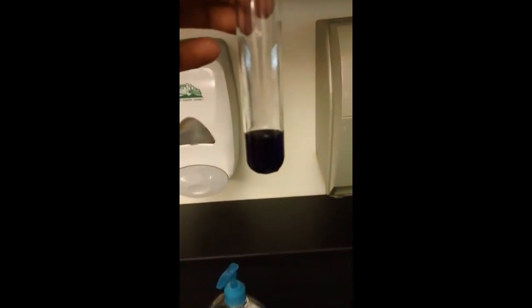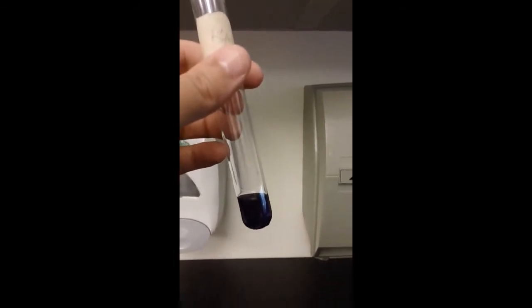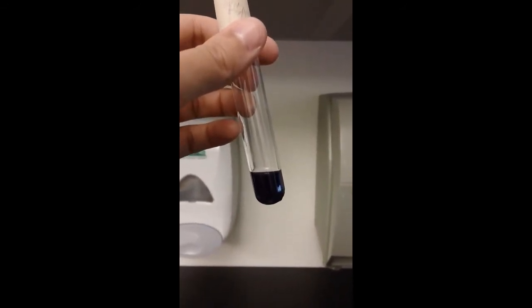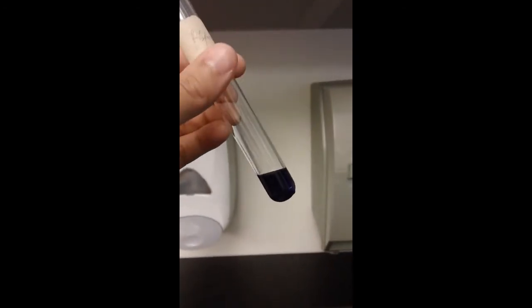Welcome back. We are on test B for our unknown, and we have just centrifuged. So record your results. Test B, unknown, we have just centrifuged. So now what you should have filled out down here is you should have this filled out, you should have this filled out, and now we need to run test C.